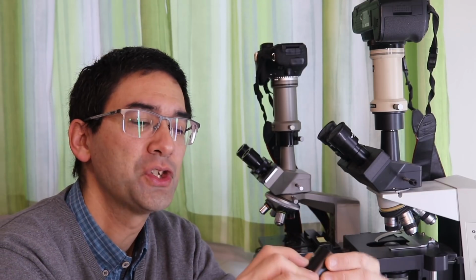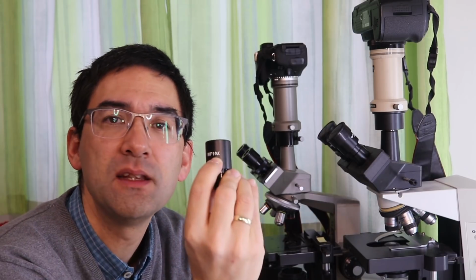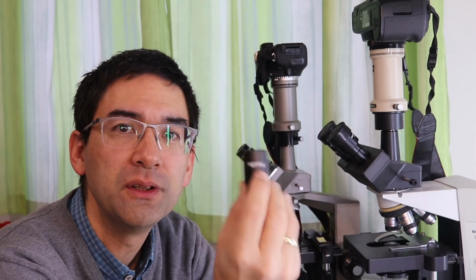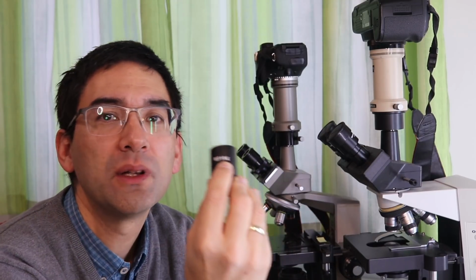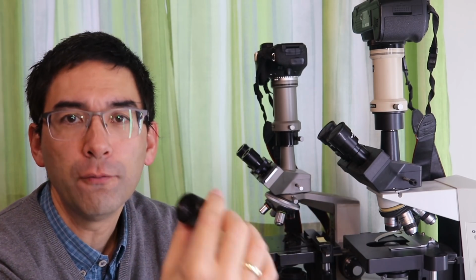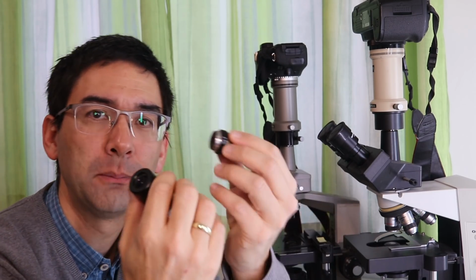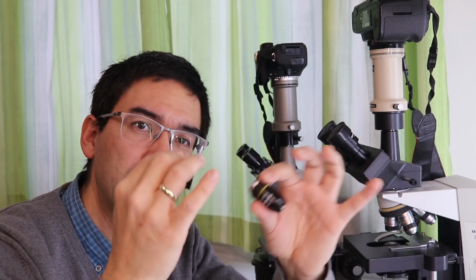The first important thing is the magnification of the eyepiece. This one is in almost all cases printed on the eyepiece. Most microscope eyepieces have a 10 times or 10x magnification, and the total magnification for the microscope you get by multiplying by the magnification of the objective. In this case it's also 10 times, multiplied by 10, so in this case I would have 100 times magnification.